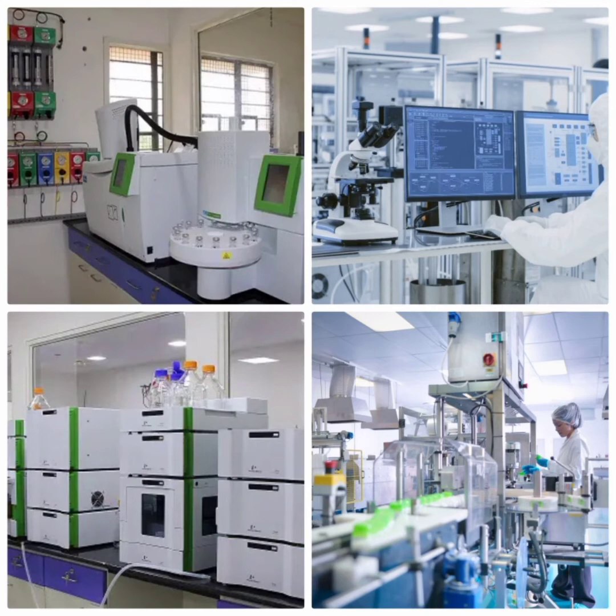Finally, to conclude, we have seen the comparison between GC and HPLC. We have compared based on sample. We have seen that the sample for GC must be volatile, low molecular weight, stable at high temperatures.